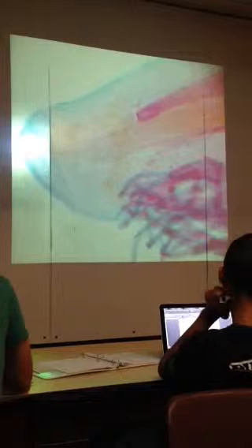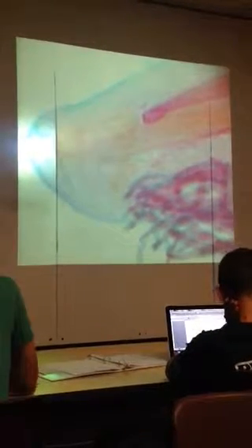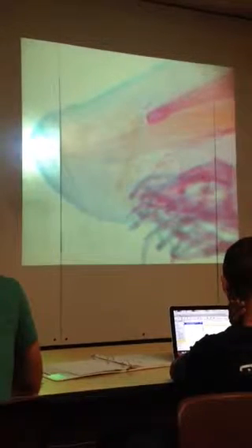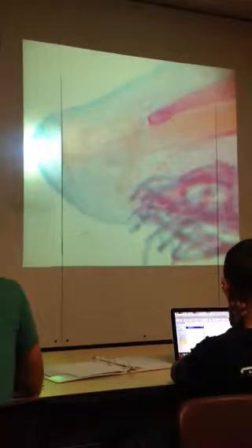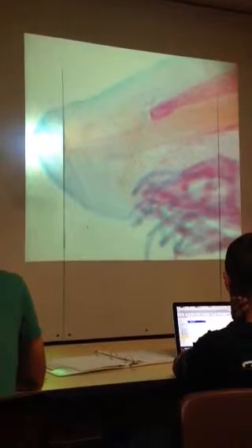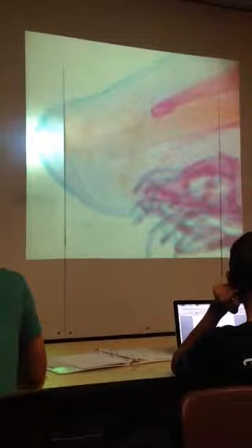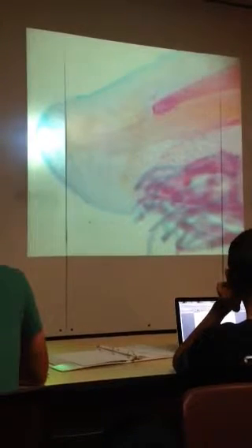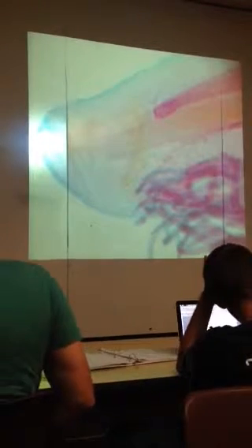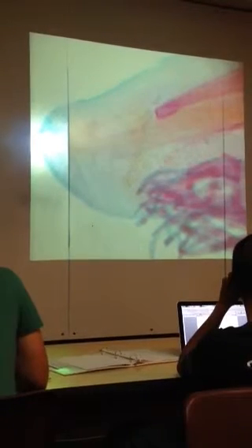But you have to be able to go low mag to high mag, because you're going to see things at both levels. The thing in histology is that a lot of students didn't spend enough time going from low mag to high mag. If you look at the liver at very low mag, you can see the central vein and all the sinusoids converging on that central vein. At very high mag, all you see are two liver cells with canaliculi in the middle. They look totally different, but you have to know it's still liver.